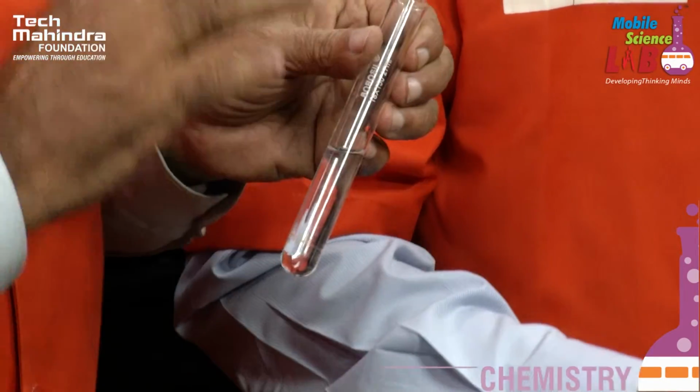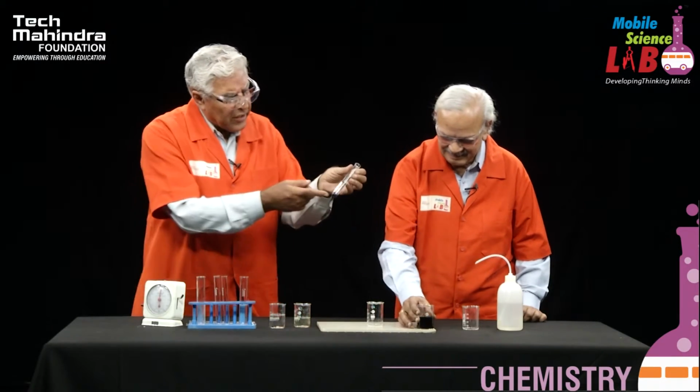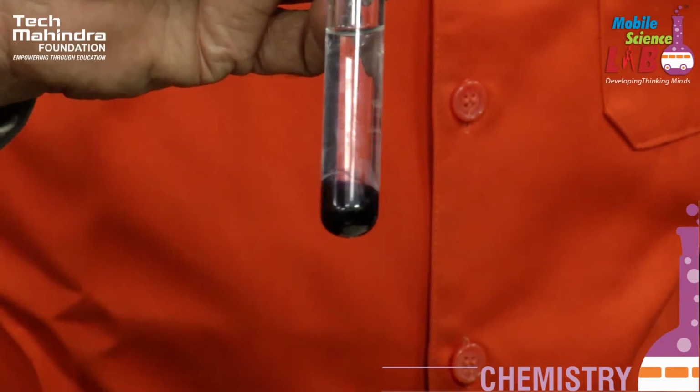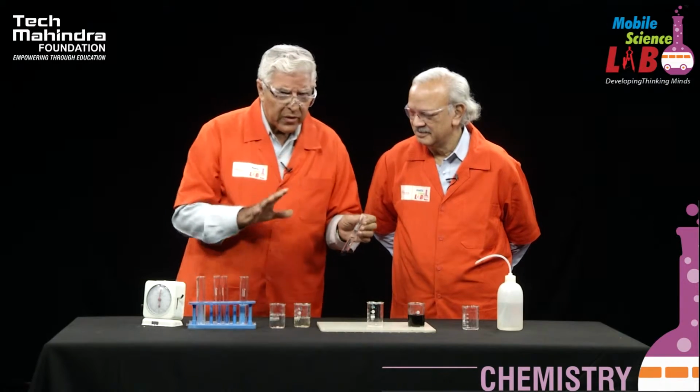That is the background. So let me summarize this for our students. There we can see the formation of that blue color again, you can see over here. That means hypo is over. Yes. So now just let me summarize what Professor has said.